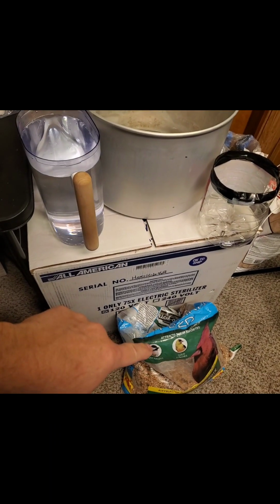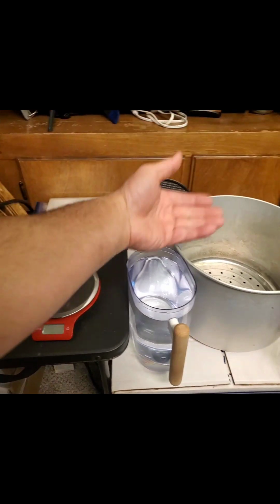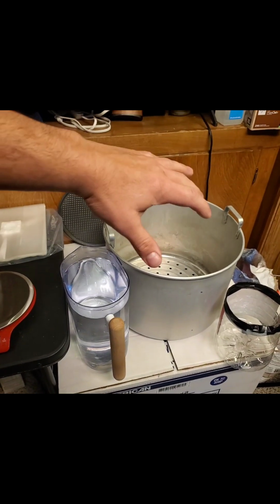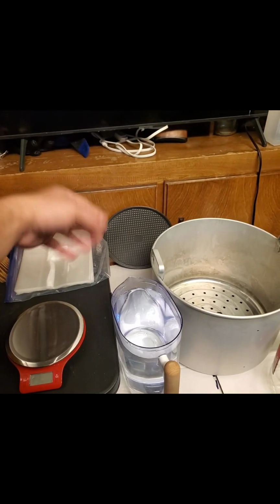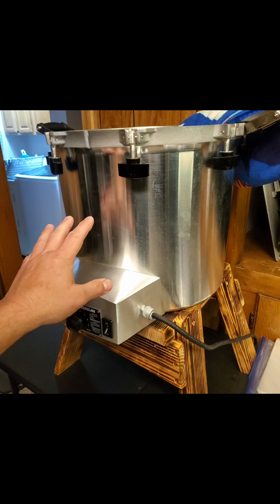1,000 grams of wild bird seed with 600 grams of water in each bag. Fold them accordion style. Set them in there, three on the bottom, three on the top. Put the plate on top of those. And then we're going to put them in the pressure steamer.